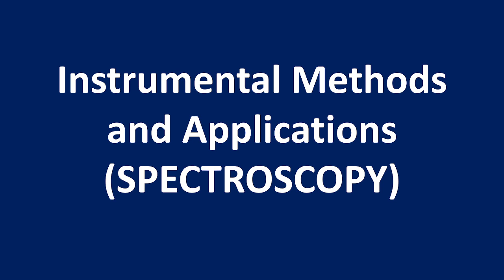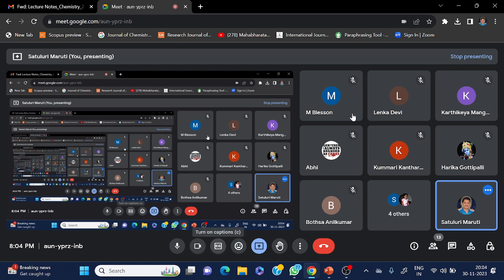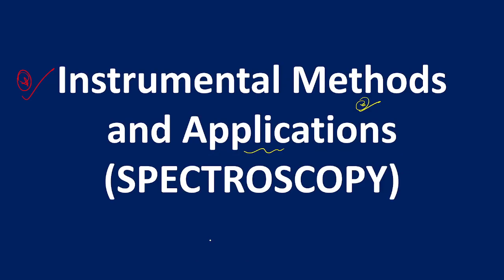Yes, today we are going to discuss the most important lesson, that is instrumental methods and applications. This particular important session or lesson is very helpful to us to know the entire structure of a given organic molecule. That is the most important thing.